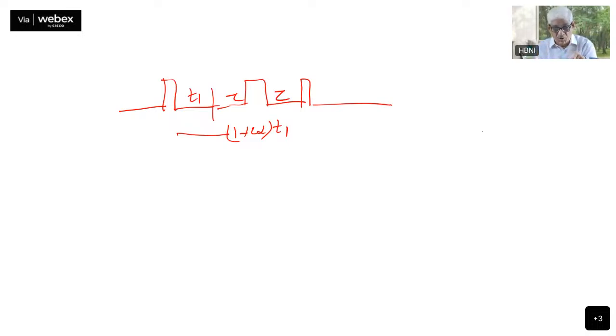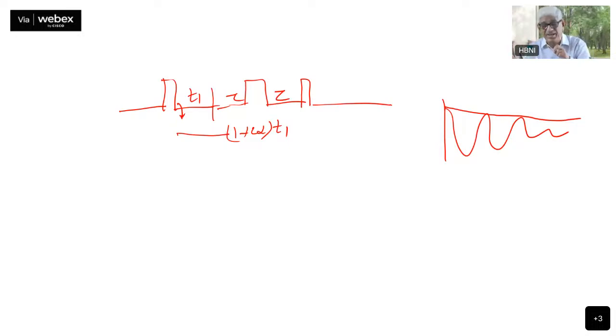Now, in the operator calculation, we did not include any relaxation. The relaxation does happen because the magnetization is in the transverse plane here. Magnetization is precessing in the transverse plane and that will go through T2 relaxation. How does that usually affect things? Let's say you have an FID, it is decaying. The FID decays for two reasons. One is the recovery along the z-axis, the other is the decay in the transverse plane because of T2 relaxation.